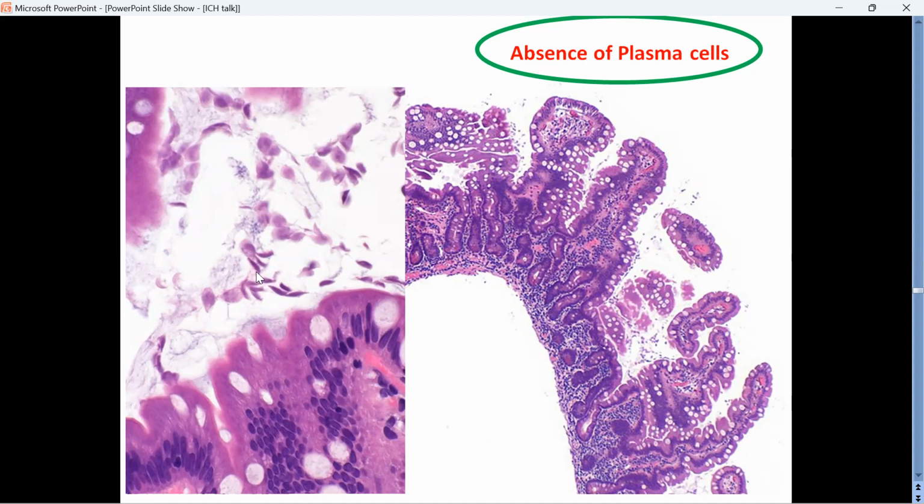But we should take some extra time to look at what's happening. Are there any plasma cells? In this case, you should look whether there are plasma cells. This case showed absent plasma cells. That takes you closer to the diagnosis that there is something abnormal. You have B cells, but you don't find plasma cells, so there is some problem in B cell differentiation. You find giardia, and you find lymphocytes in the subset analysis, but you don't find plasma cells in the biopsy.